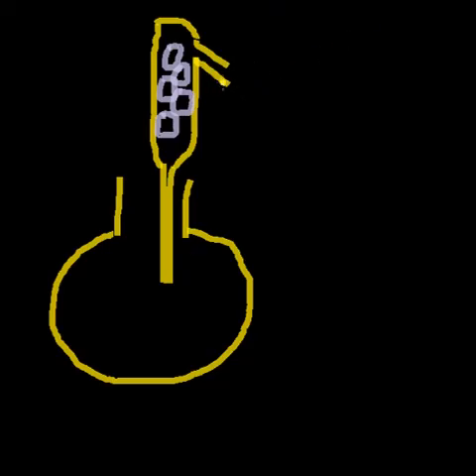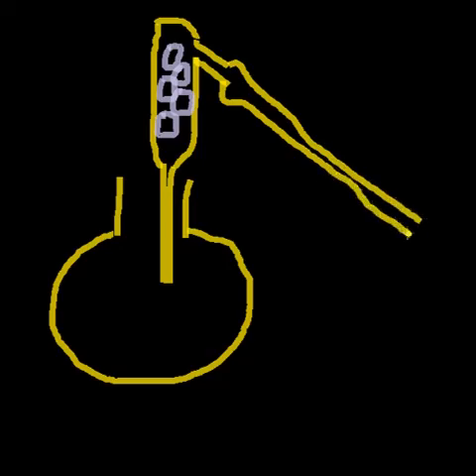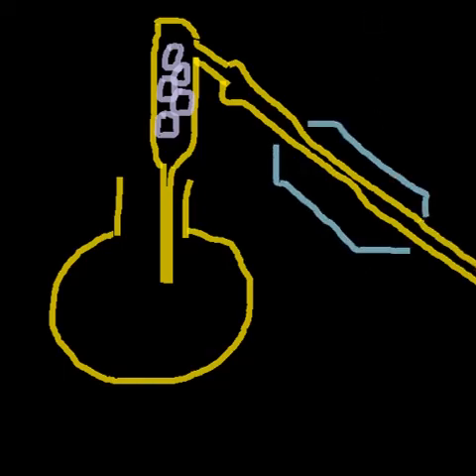Now, the delivery tube, as earlier, passes through a condenser and then comes out from the other side into a container. So here we may have a condenser, and this condenser is always fed with a supply of cold water so that it can condense the vapors passing through the delivery tube.